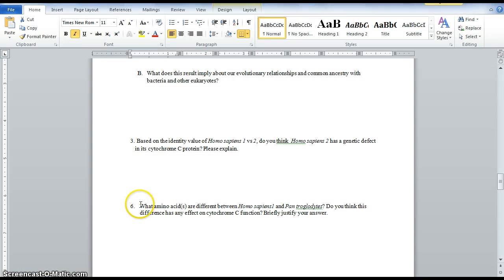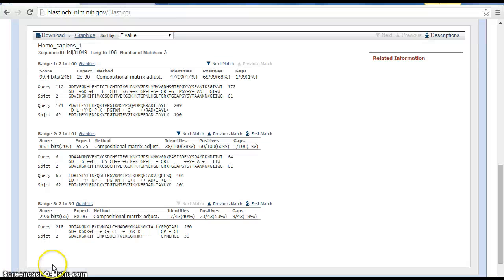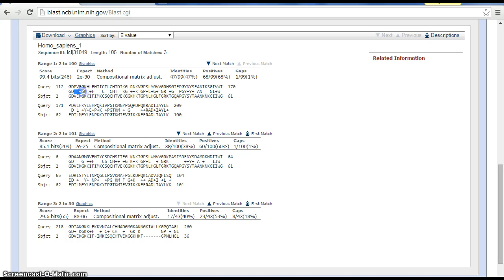When you look at question six, which is what amino acids are different between Homo sapiens one and Pan troglodytes, which is the chimp, what you want to do is go to your sequences and look for the blank spaces or the plus.